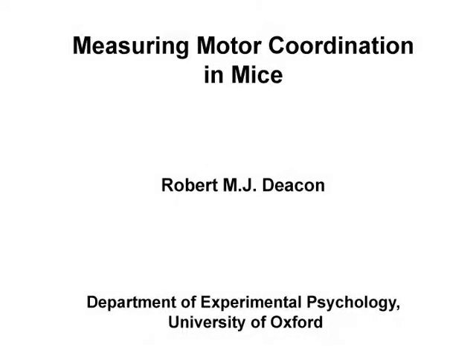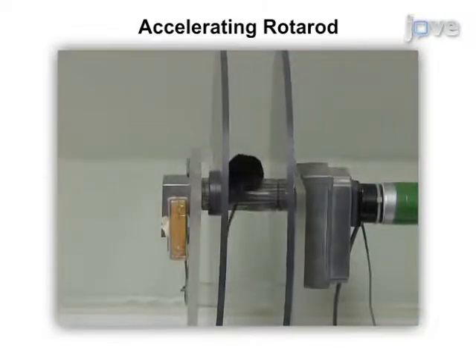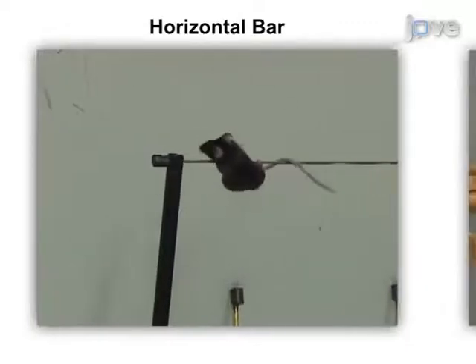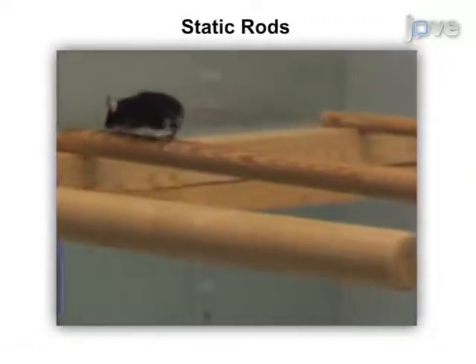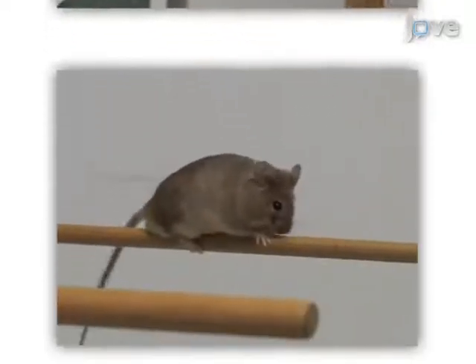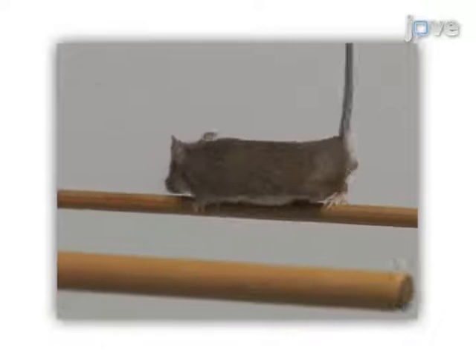The overall goal of this procedure is to measure motor coordination in mice. This is accomplished by first testing on the accelerating rotor rod. Next, motor coordination is tested on the horizontal bar. The animal can also be tested on static rods. Lastly, performance on the parallel bars can be measured. Ultimately, results can be obtained that show whether the mouse has any impairments in motor coordination.